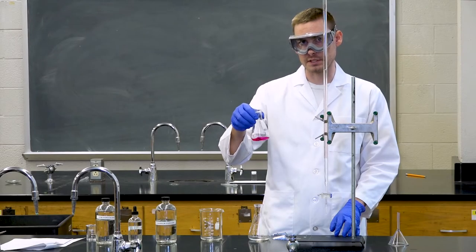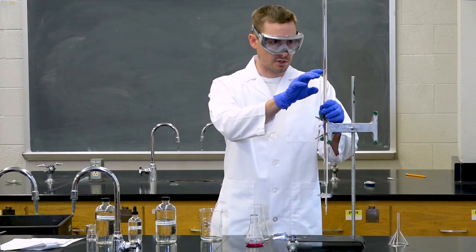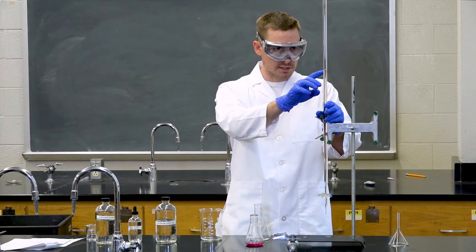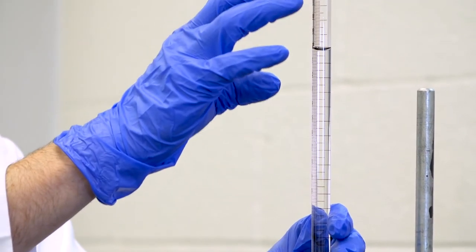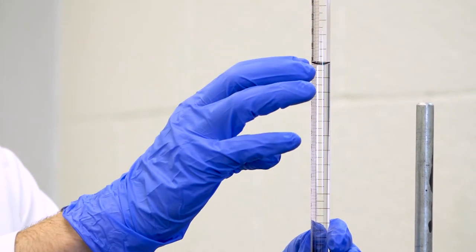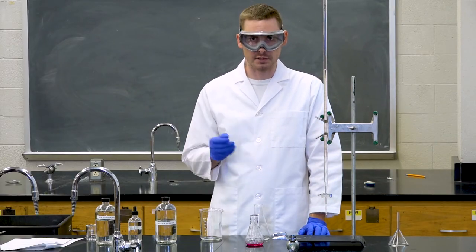So now that we know we've reached the end point of the titration, we can then determine, by reading the gradations on the side of the burette, how much we have added by subtracting the initial volume from the final volume. We can then use that information to calculate the stoichiometry of this reaction.